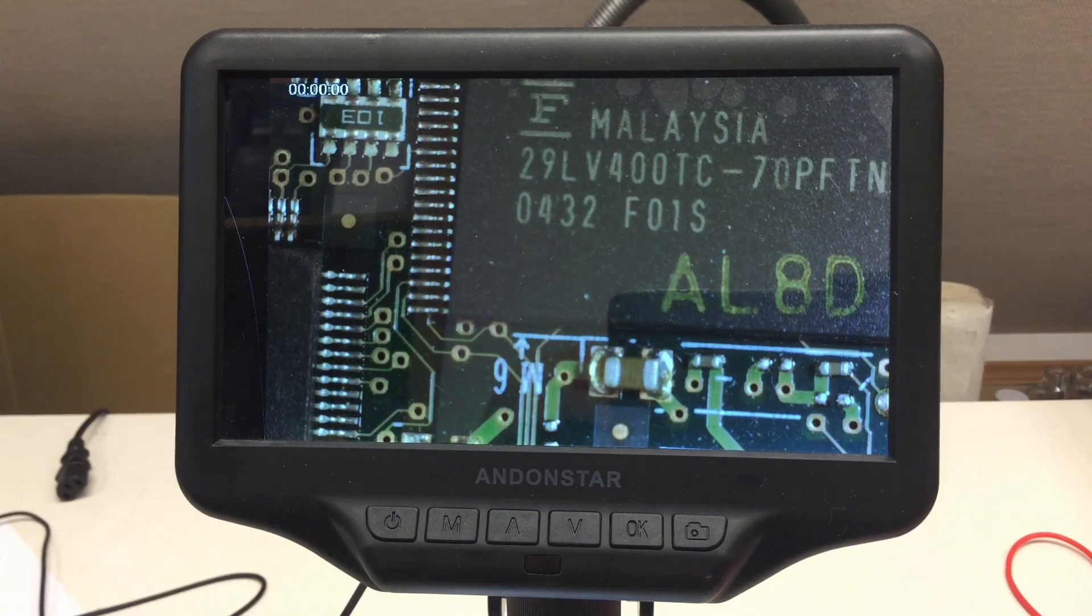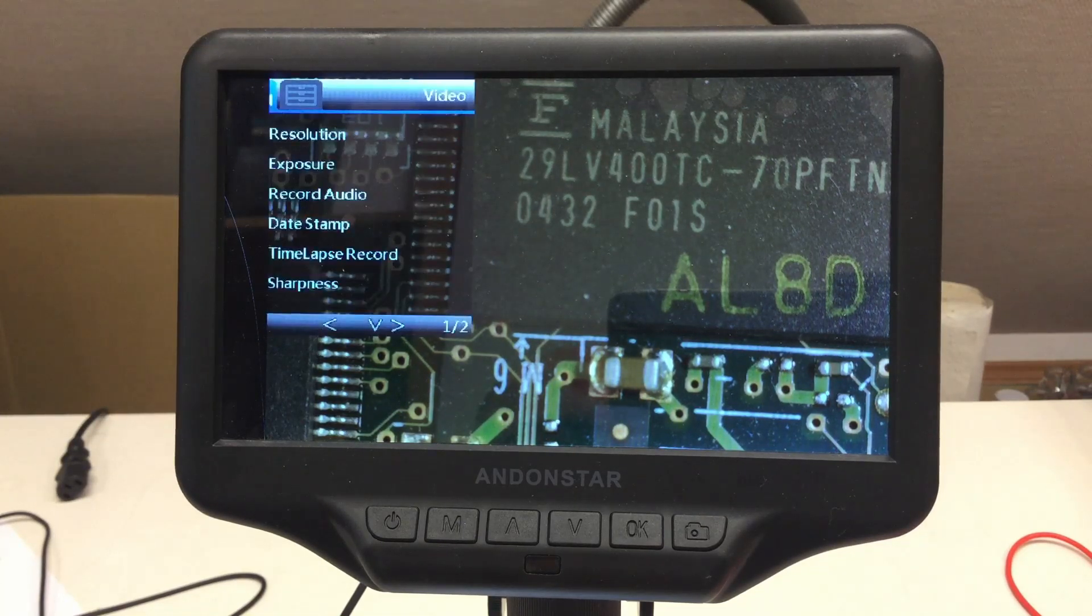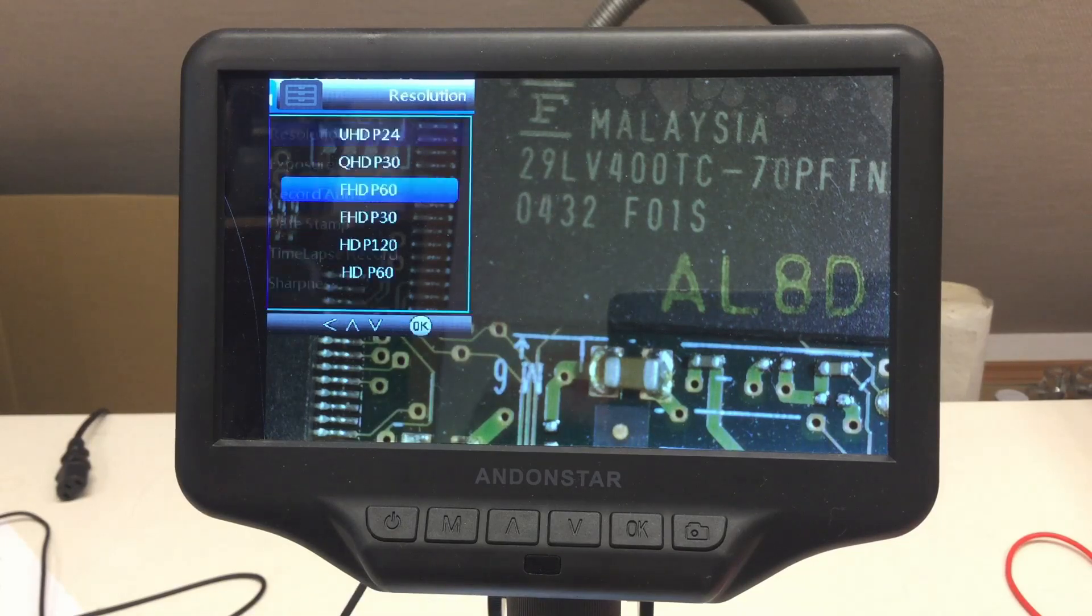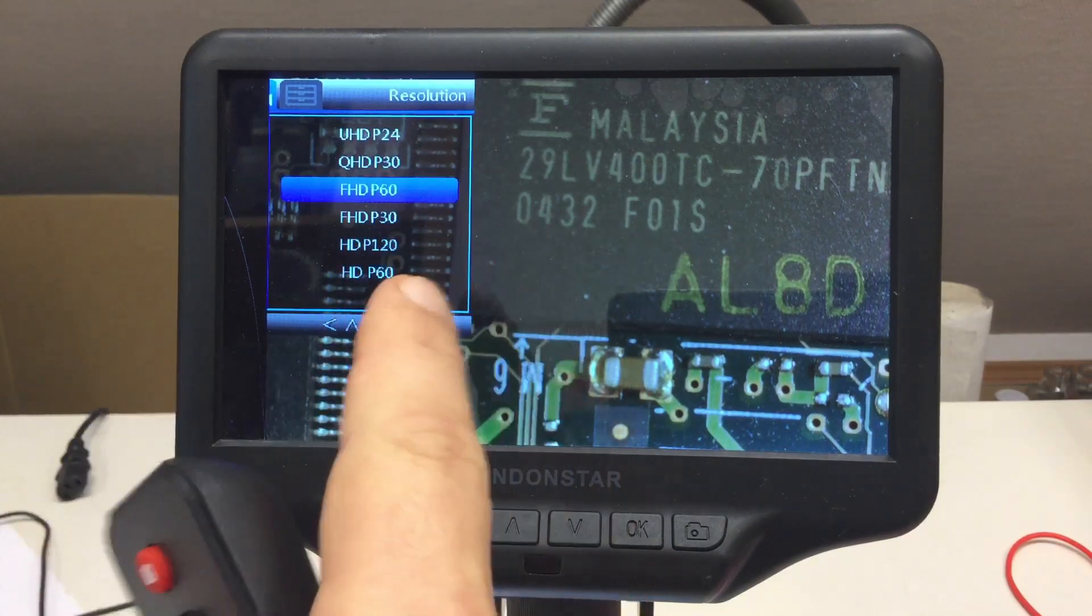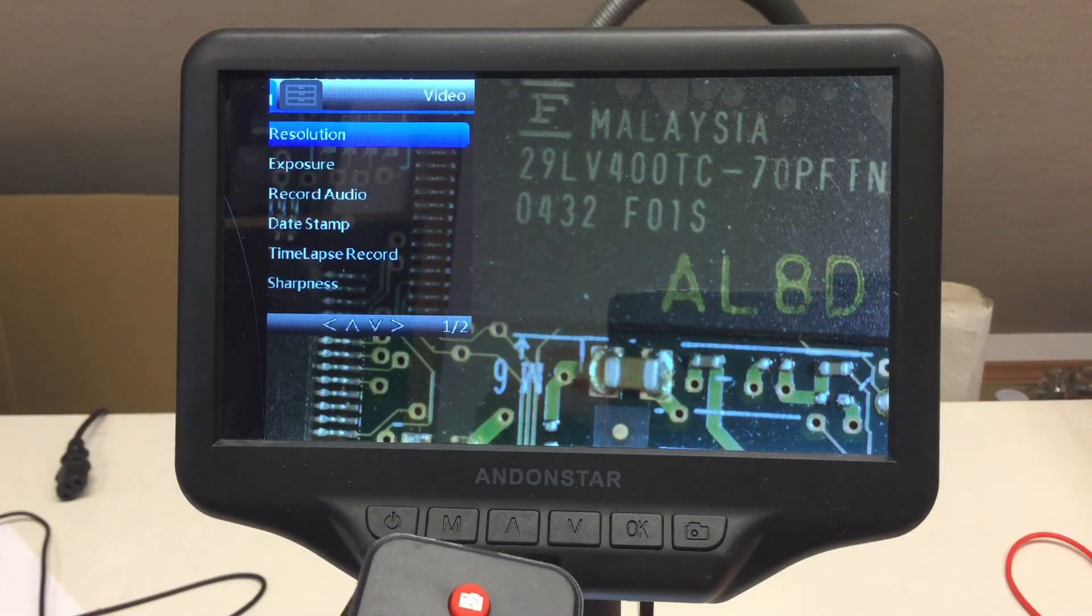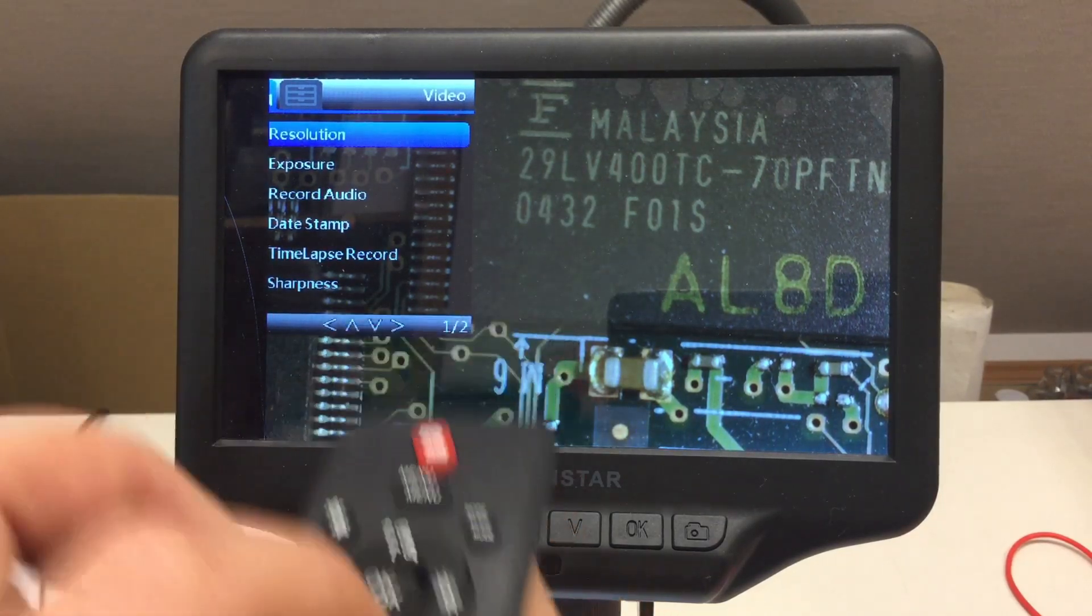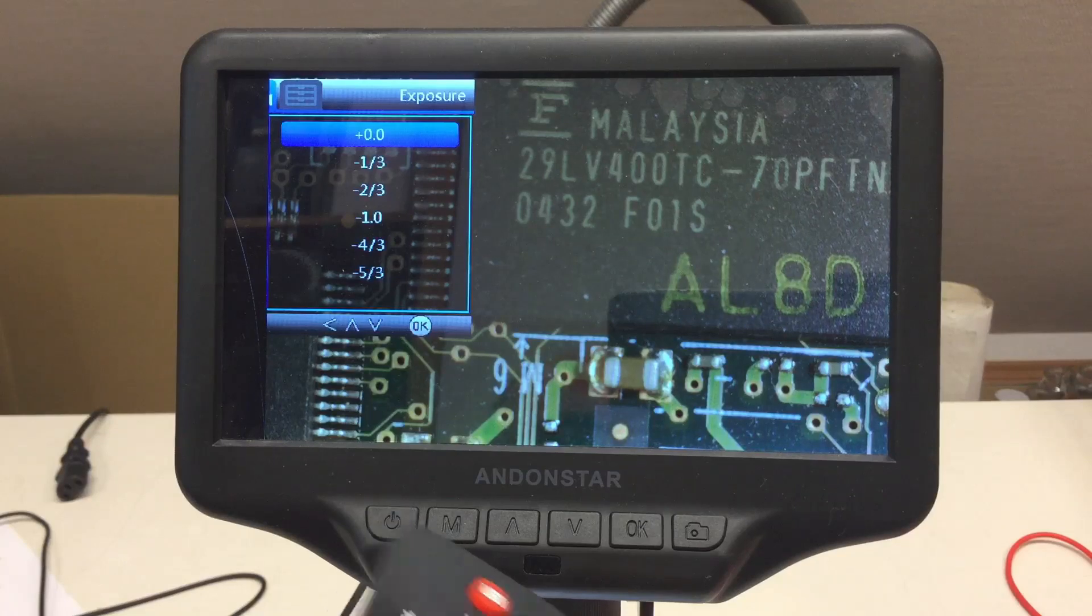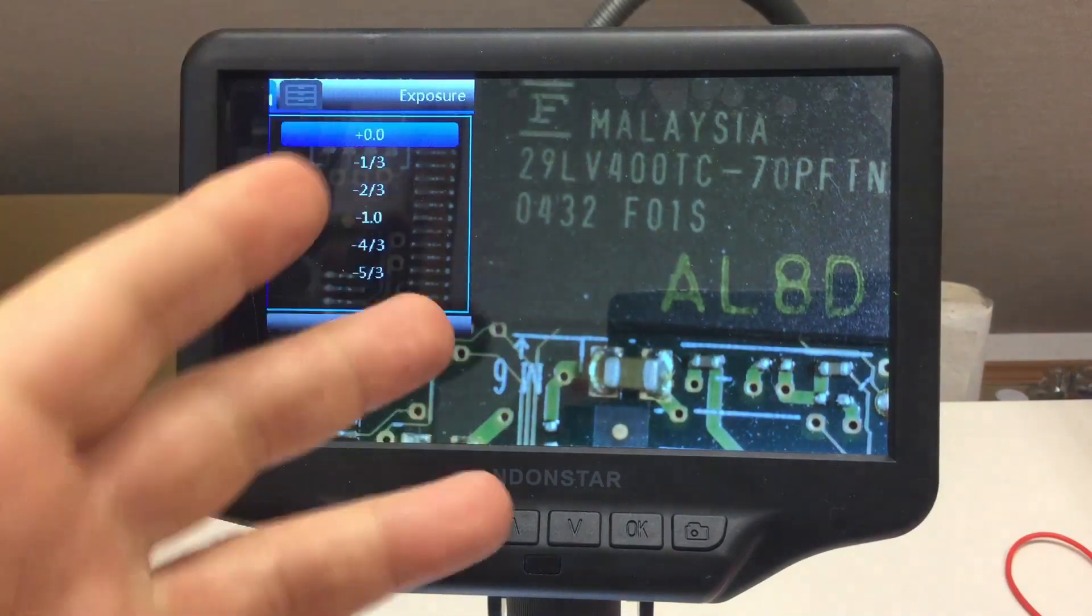And if I go to the menu again, ah, Jesus, this is really, resolution, come on. We are back to full HD P60 instead of full HD P30. And my exposure, I'm really trying to put that here, is back to zero. So no, it doesn't remember any settings.